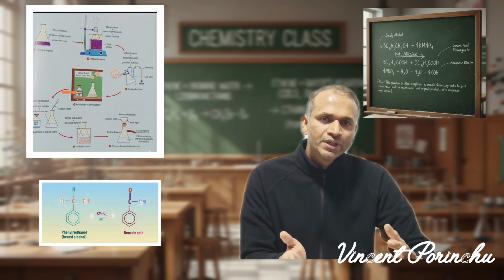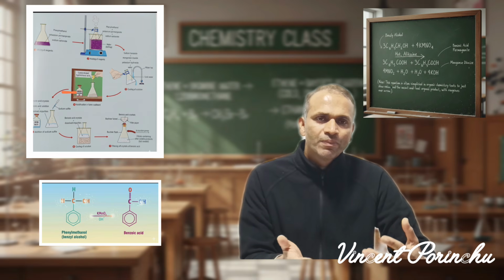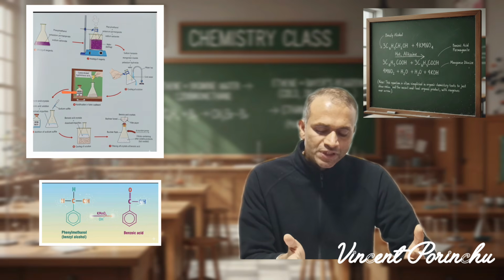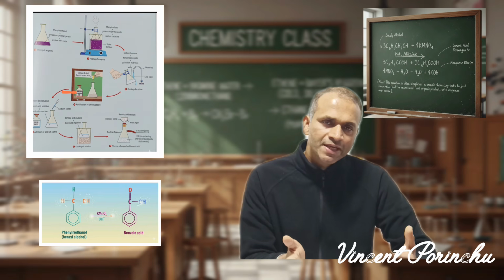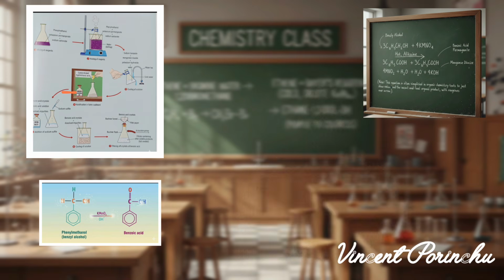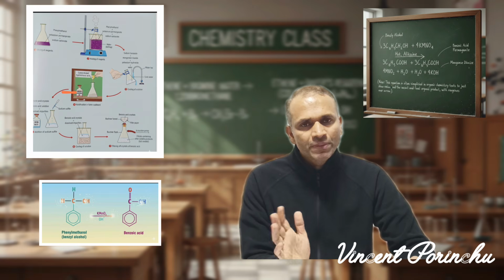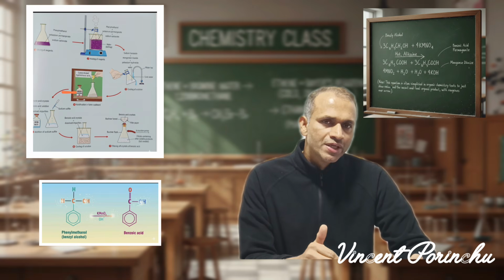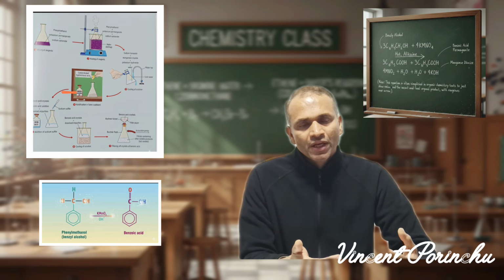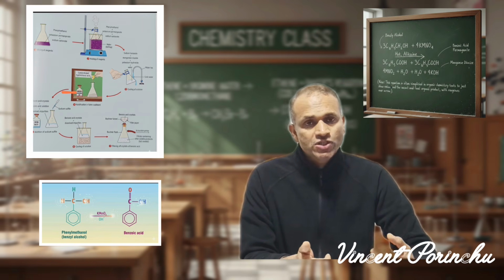Now it was a purple color because of the potassium permanganate earlier. And from the 4th step, you can see the color of the mixture in the conical flask become a brownish color. So the purple color turns to brown. After acidification, we have to separate the contents of the mixture.